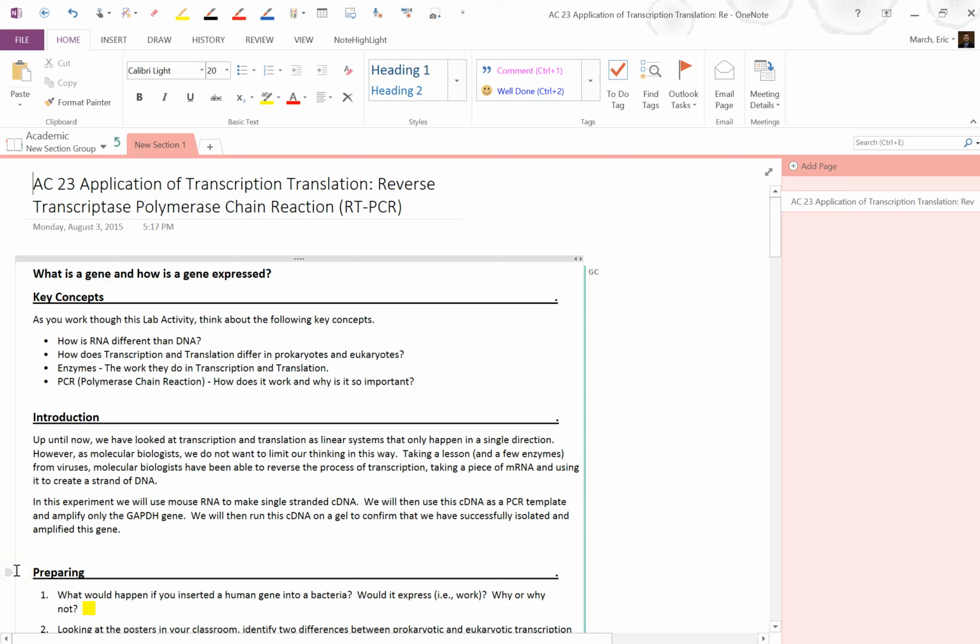Today we're going to talk about AC23, the RT-PCR lab. It can be a little bit confusing, so we're hopefully going to walk through exactly what it is you're doing and what all of the reagents that you add to the tubes do.